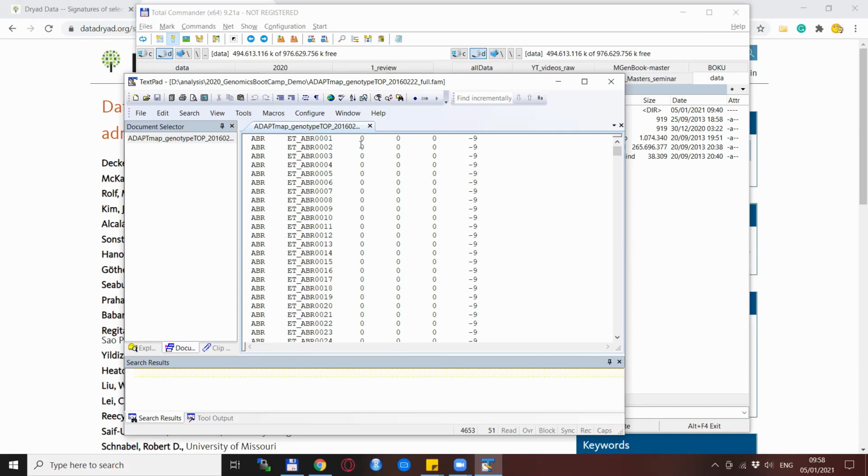The next two columns are the ID of the father and the mother of the individual, which is stated in column 2. Now, this is frequently either not available or whoever puts the data together does not consider it to be important. So it is designated as unknown. That is why there are zeros here. The fifth column is the sex of the individual. So I believe 1 should be for males, 2 for females. And 0 is also just saying that it is not available or missing.